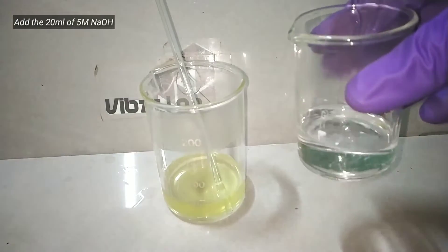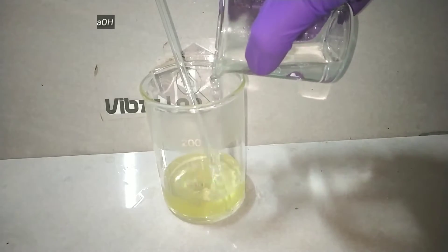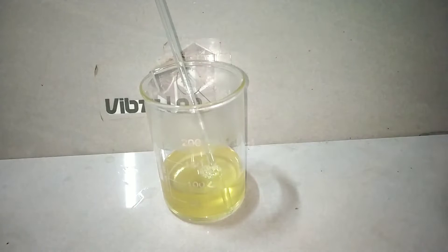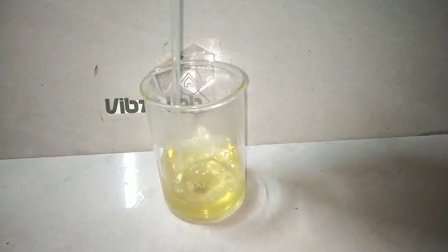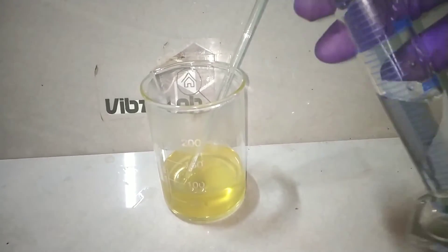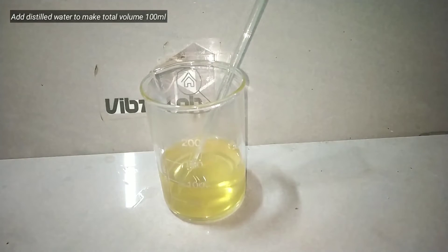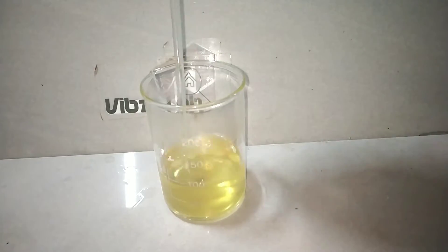The next step is to add the sodium hydroxide solution. We add 20 ml of the 5 molar sodium hydroxide solution that we prepared. On adding the sodium hydroxide, you can see the color becomes a little more intensified. The next step is to add distilled water to make up the total volume of the solution to 100 ml.